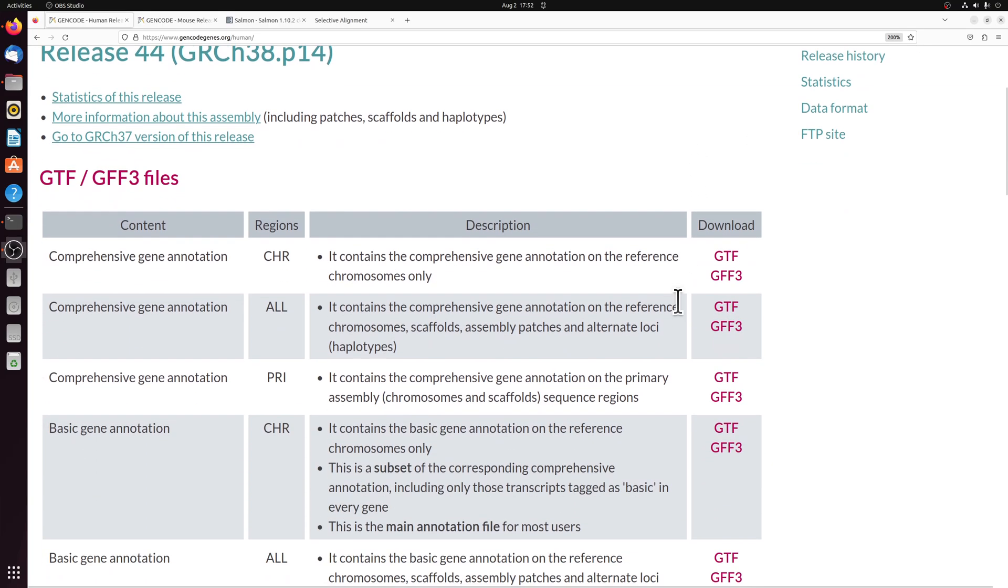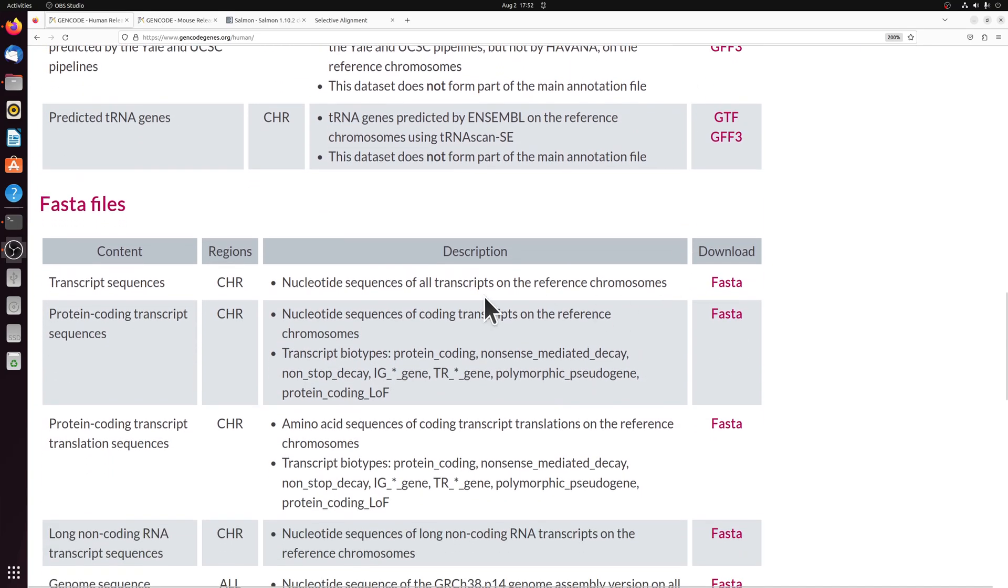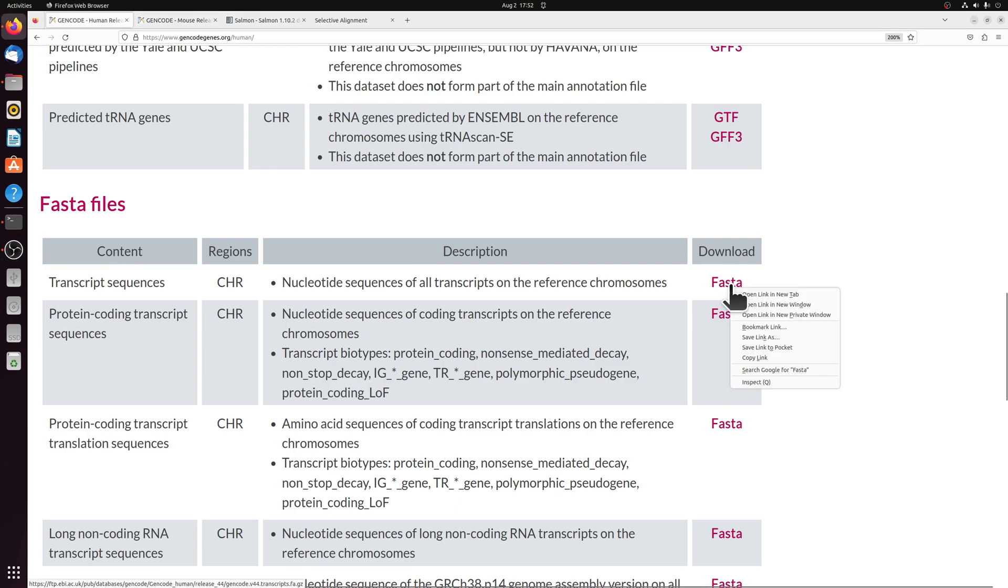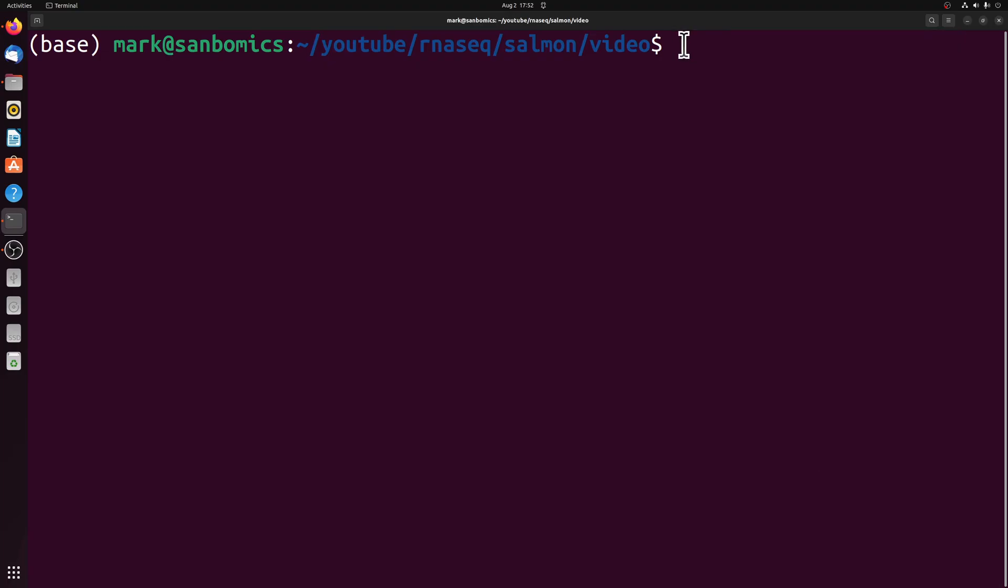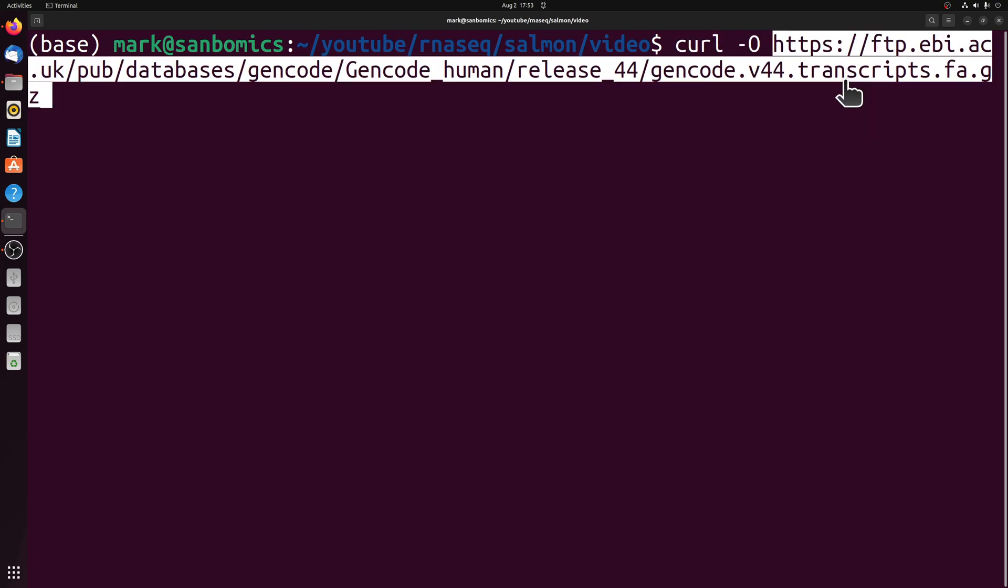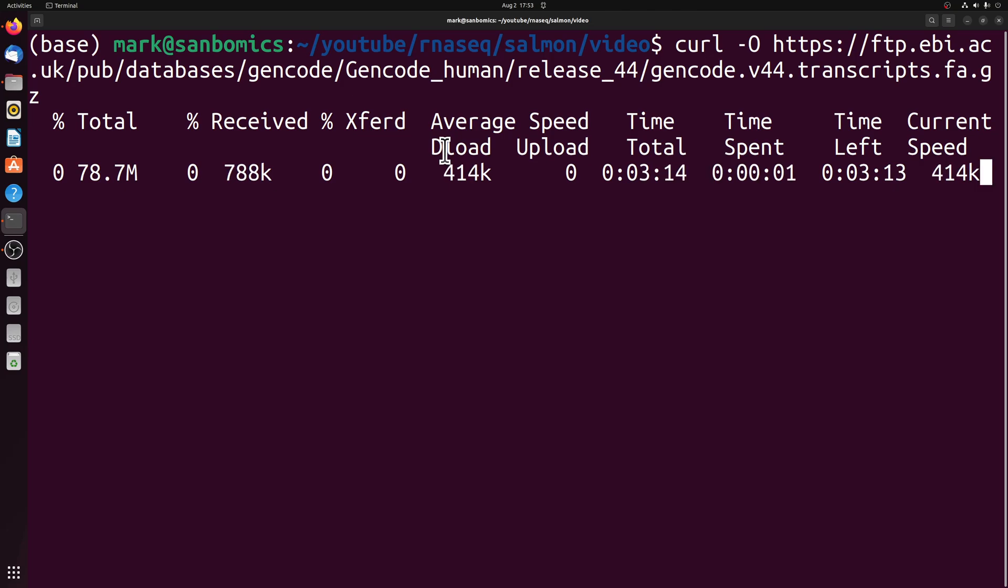When I say it's easy to use, all we really have to do is go down to the FASTA files, we can right click on the link, copy link, and then we can use curl or wget to download this. So we're downloading the actual transcript sequences.